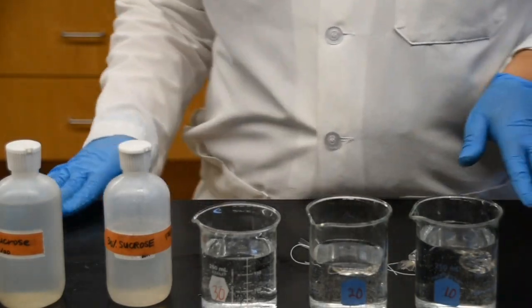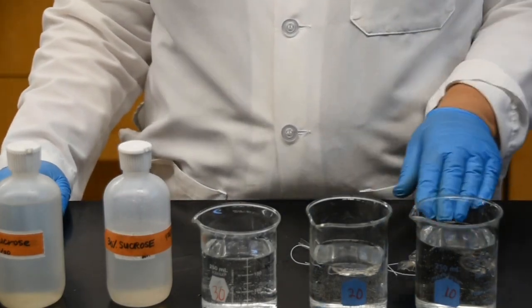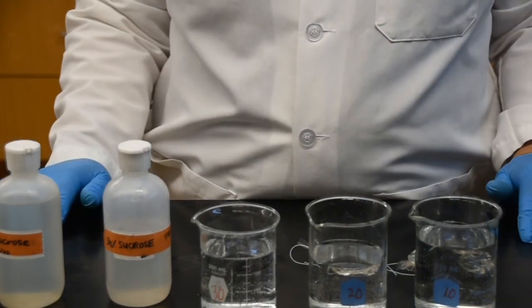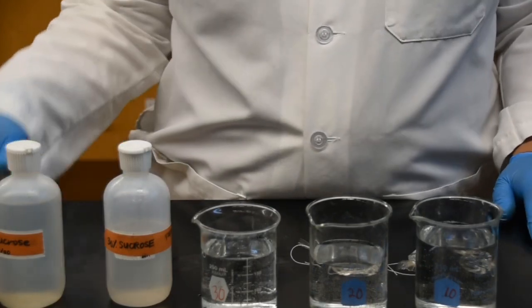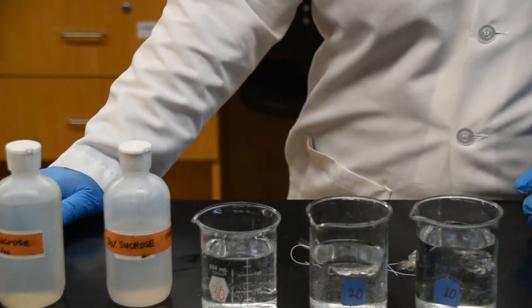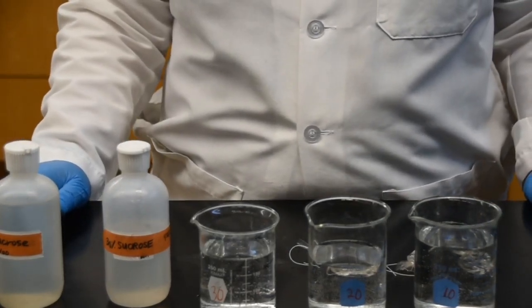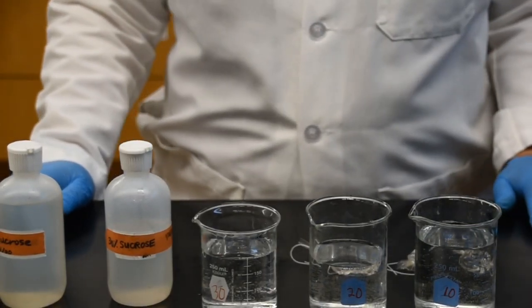Again, why am I doing this? So the goal is, this is pure water and this is sugar, right? So regardless of whether I'm talking about 10%, 20%, or 30%, water wants to diffuse into my baggies, and therefore we will observe a gain in weight for all three baggies. The question is, which one of these baggies do you expect to see having the highest weight gain versus which one do you expect to have the lowest weight gain? So take a moment, think about it, and make your prediction.